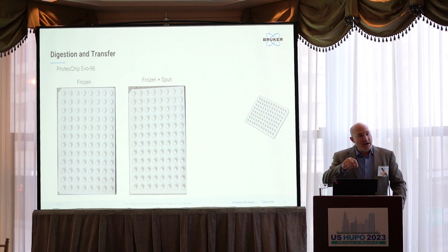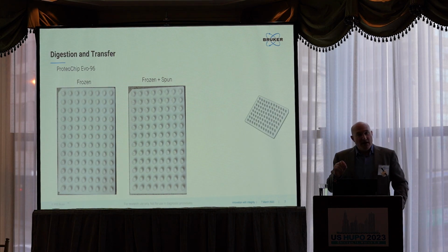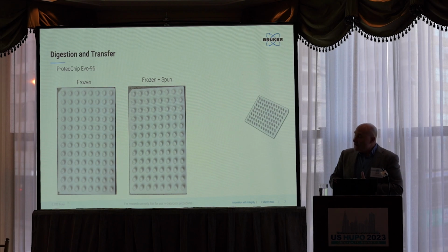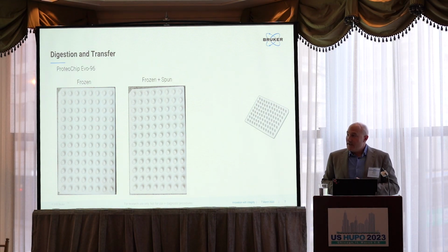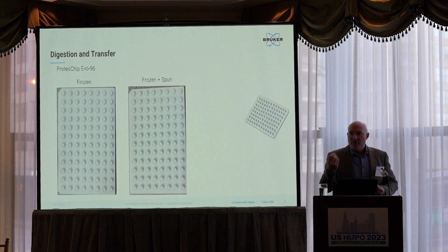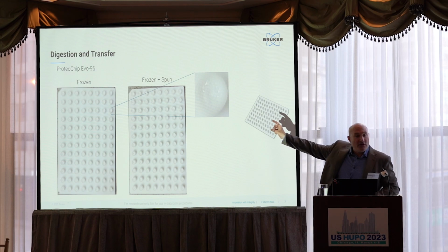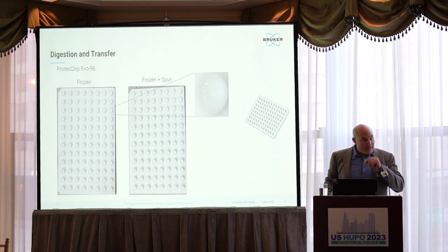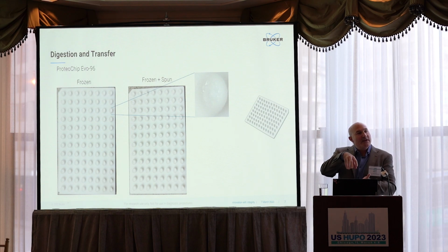So the single cells are moved into each well. Lysis digestion happens. Importantly is that oil layer. And what they figured out really creatively is that given the fact that the freezing temperature of oil is so much higher than water, then you can actually freeze these. And what happens is that the oil comes to the side, opens up a little pore, and then you have a way to get your digested single cell material out. So what I'm showing you here is a zoomed in section of a frozen plate where a single cell has been distributed into that cell. And then they spin this, so they can take this plate when it's still frozen, which means 4 degrees C, put it on top of the Evo box, right?